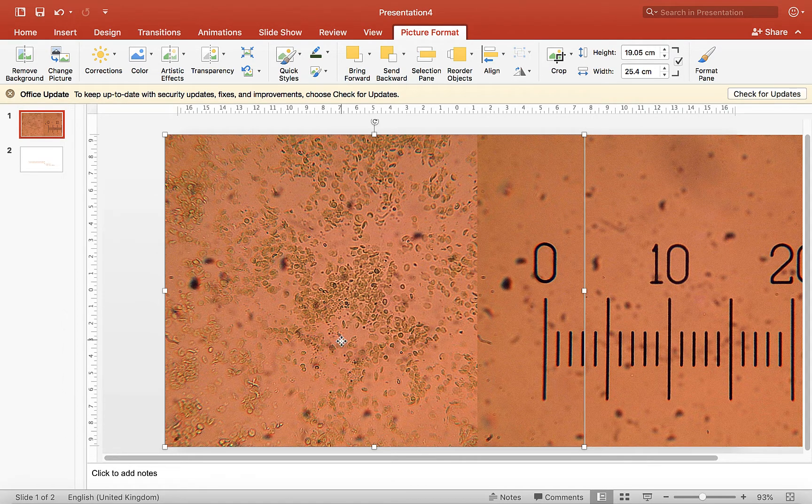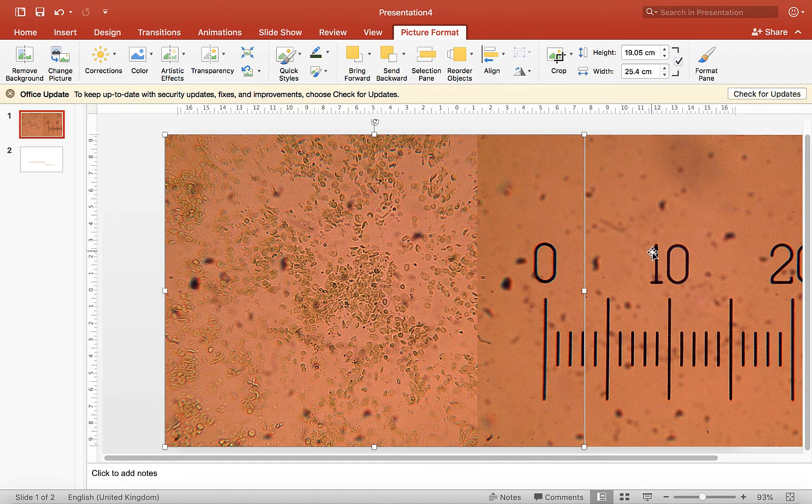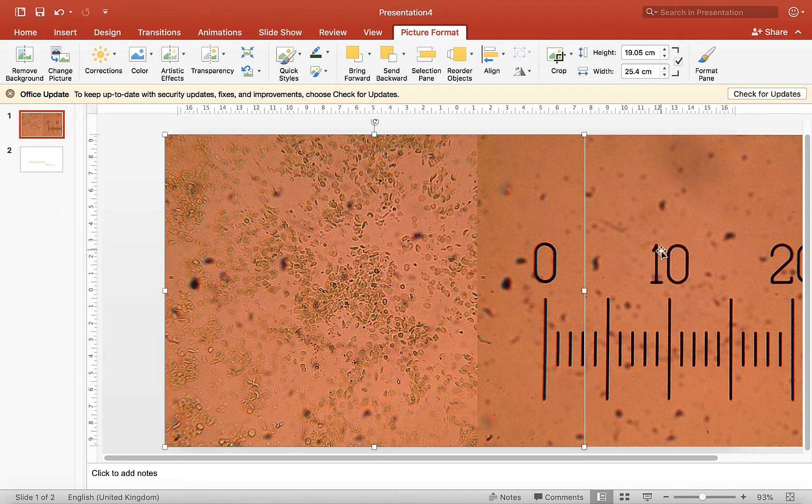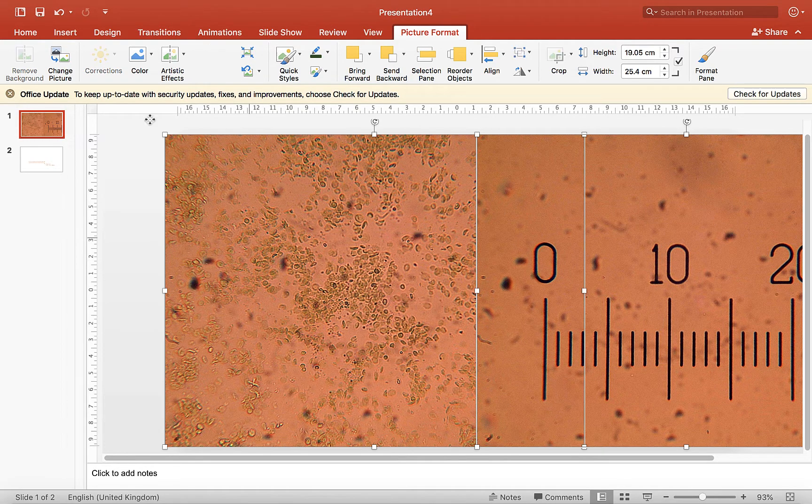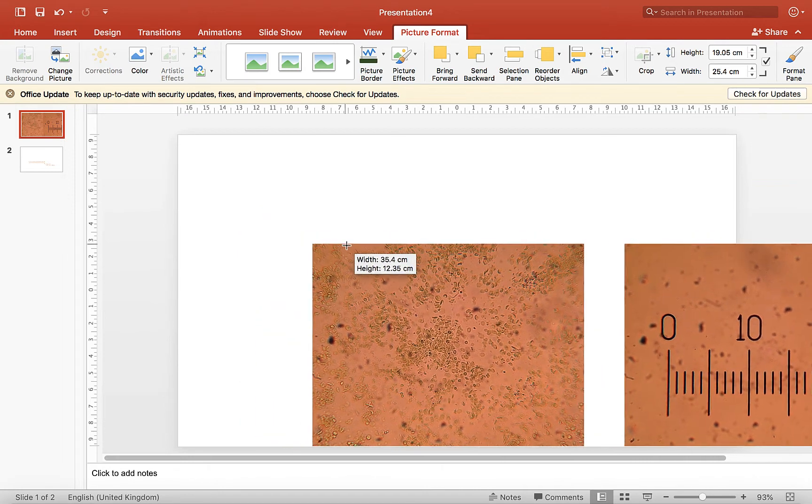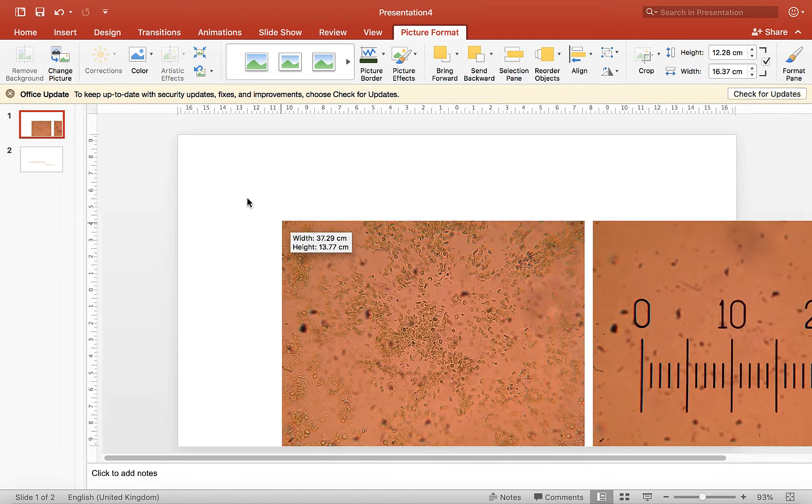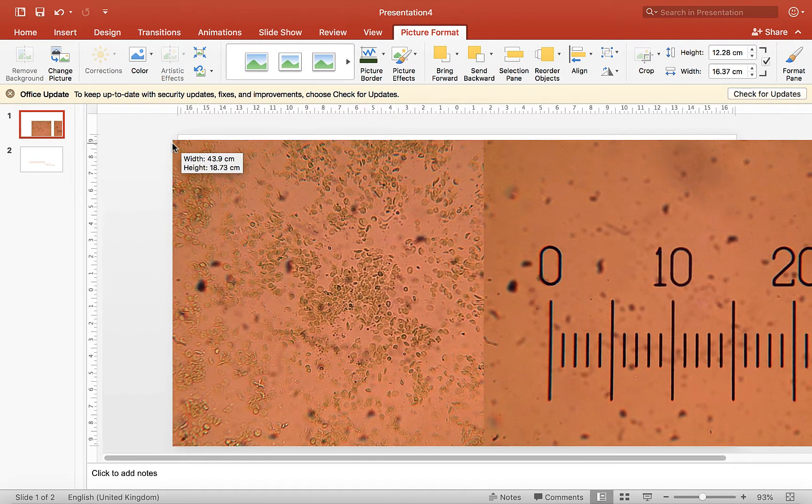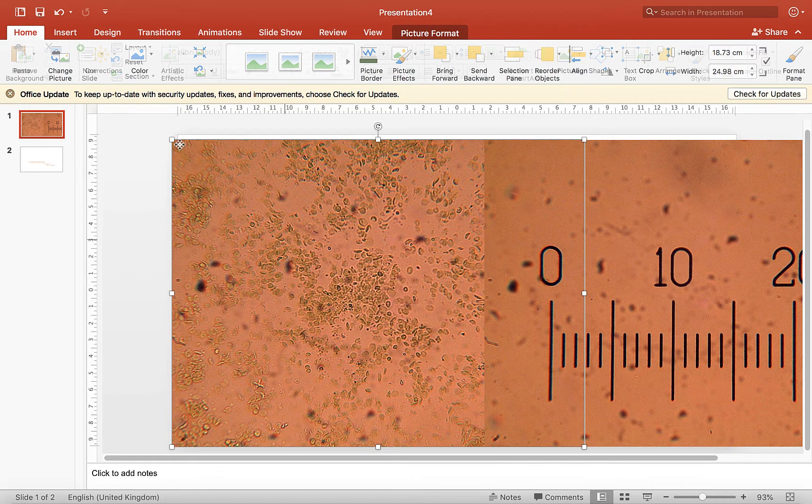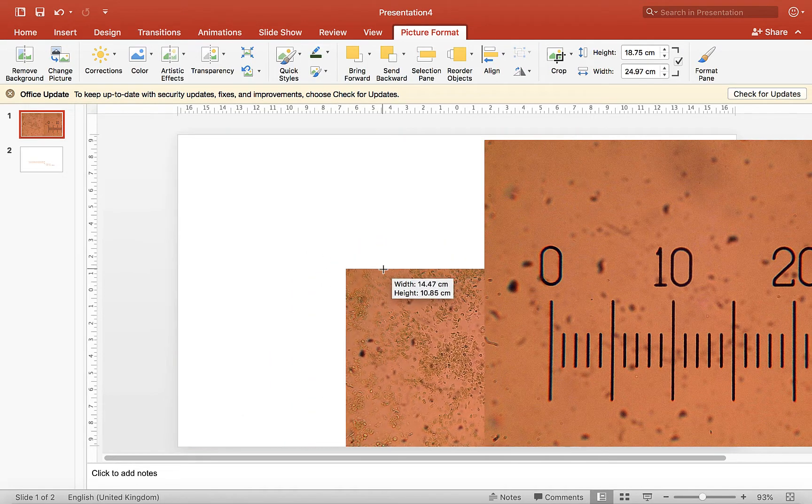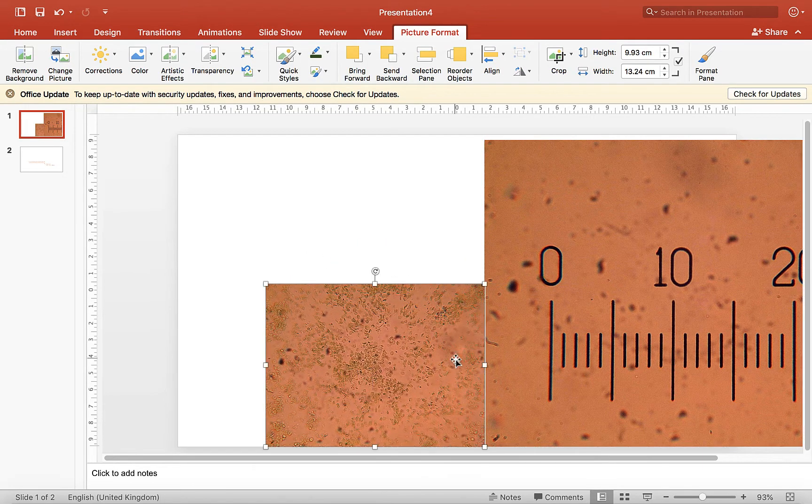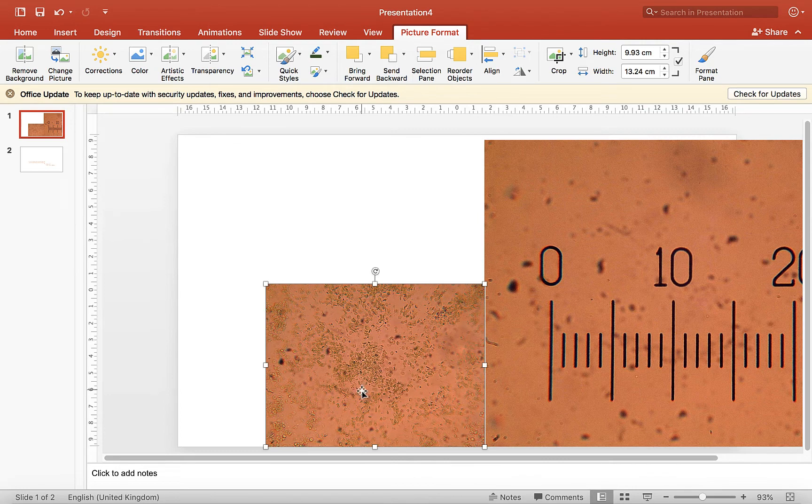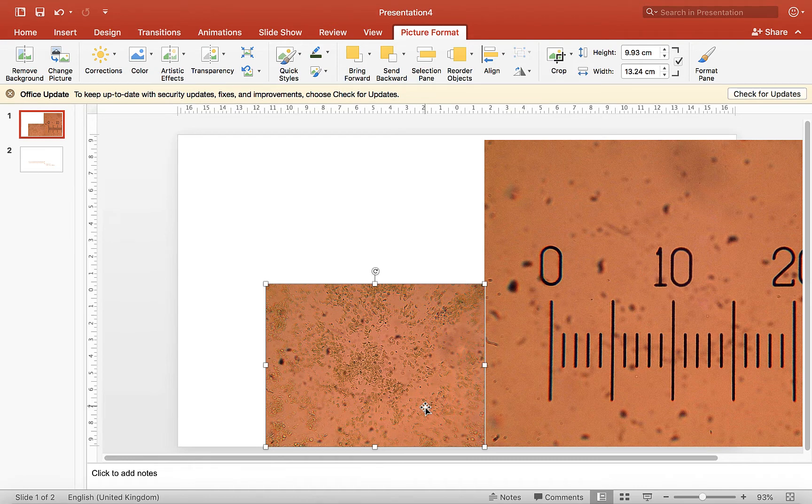What's really important when you're doing this is you've got to treat the two images the same. So if you want to resize them, then you need to click both of them together and resize them together so that the relationship holds. Whereas if you just pick one of them and you resize this one, suddenly we've broken the relationship, I've no idea how big things are on this image because they're now sized differently so the relationship is broken down.